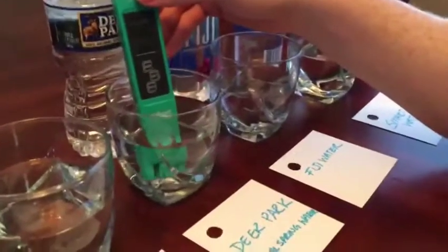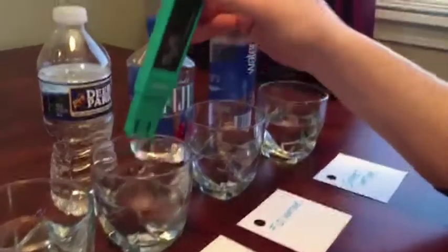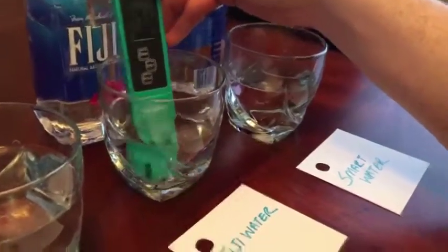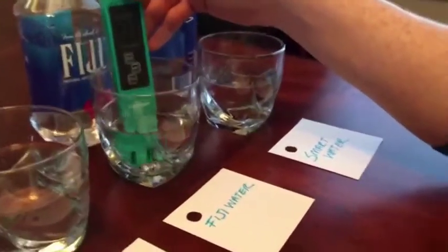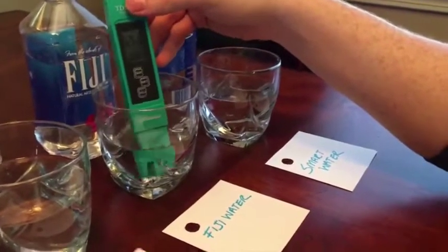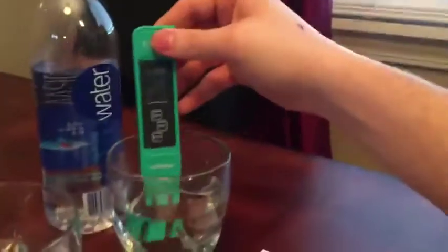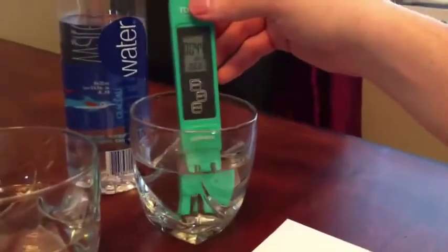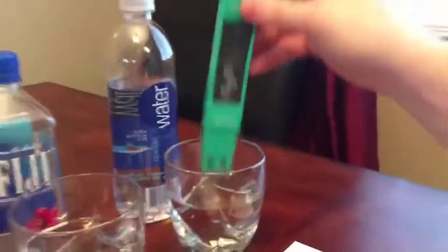This is the Deer Park water, measuring a 6, slightly above. Fiji water, 263. So we definitely have quite a bit of not only dissolved solids, but a pretty high content of salt metals. Okay, let's test our smart water now. 44. So this is a really good tool, and it's going to help us see exactly what is in our water.